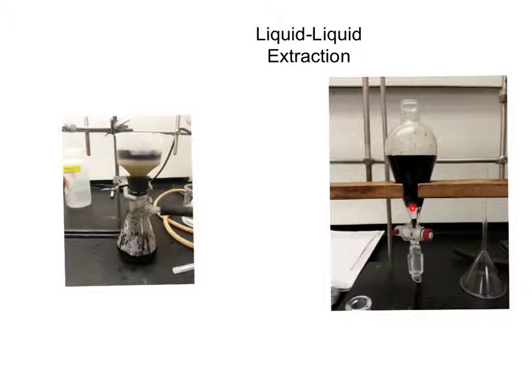We mixed it with dichloromethane, which is nonpolar, which is why they are immiscible. And we see that here, the two layers, methylene chloride at the bottom and the aqueous solution on top. The reason one's on top and one's on the bottom is just a difference in density. Because of the sodium carbonate, caffeine does dissolve in dichloromethane.